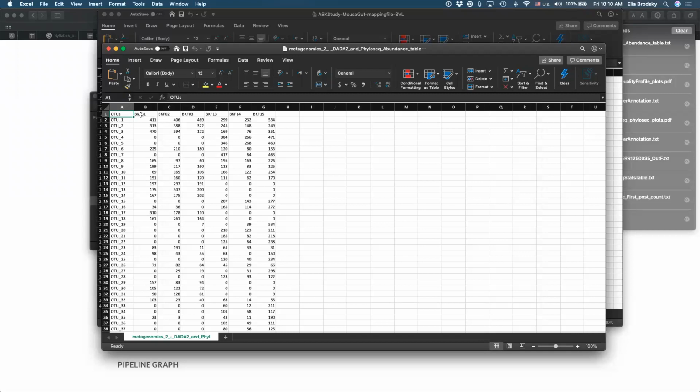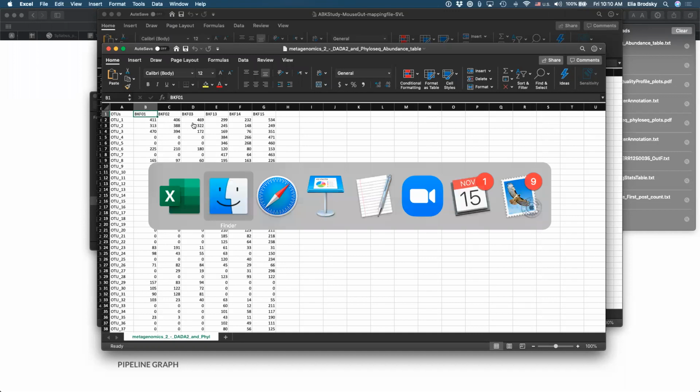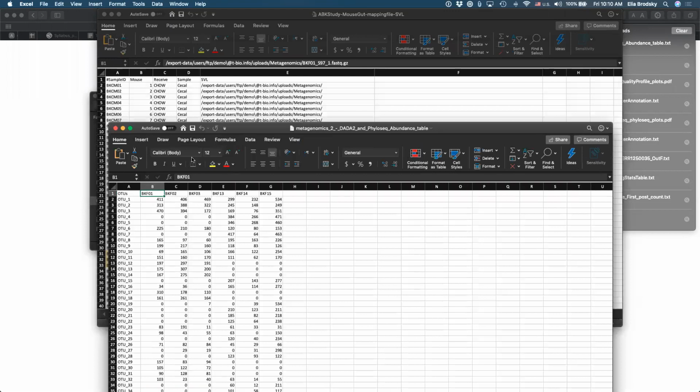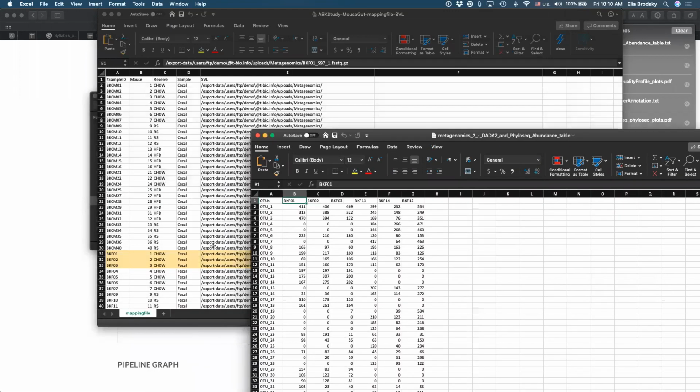So again, here we see, right, who remembers what are the 1, 2, and 3? Who remembers what are BKF 1, 2, and 3? Okay, how do we know what is BKF 1, 2, and 3? We can go into our other table, transcripts. No, so these are samples, right?